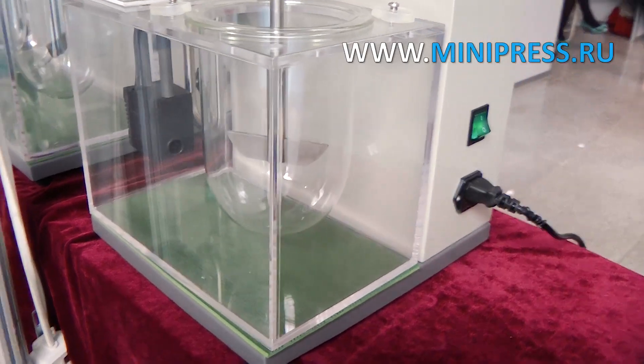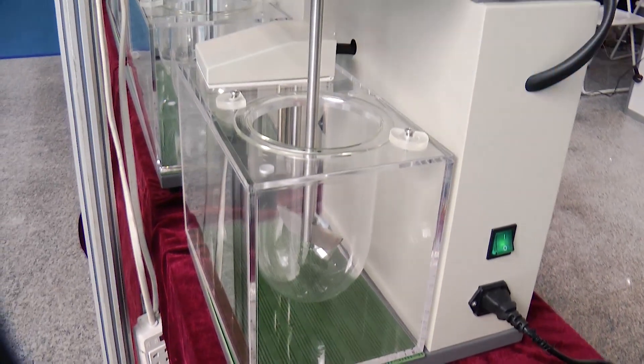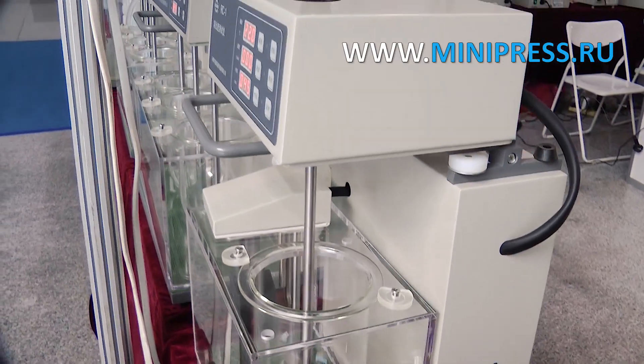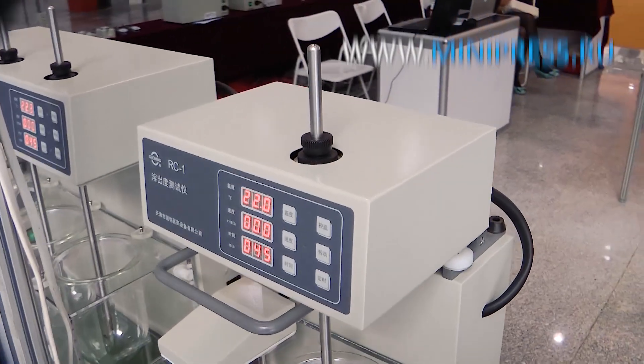The water flow is circulated by a magnetic pump, distributing it evenly through the system, and the water bath maintains the same temperature. This tablet dissolving device is equipped with automatic control of temperature, speed change, and time.